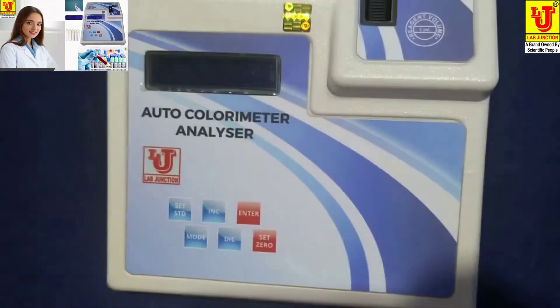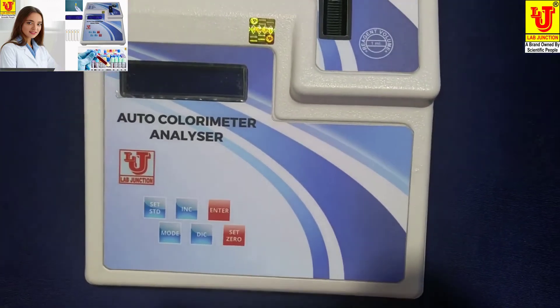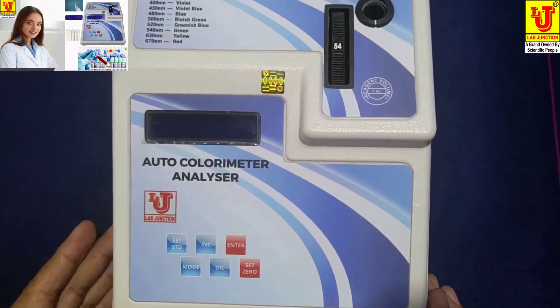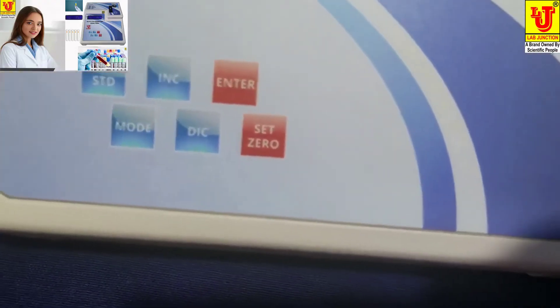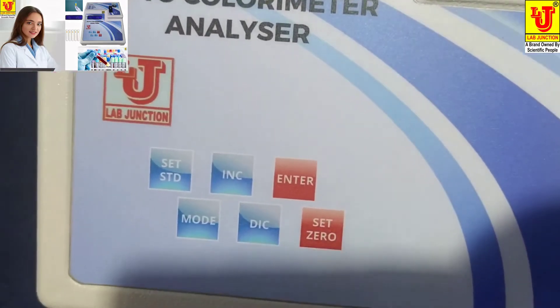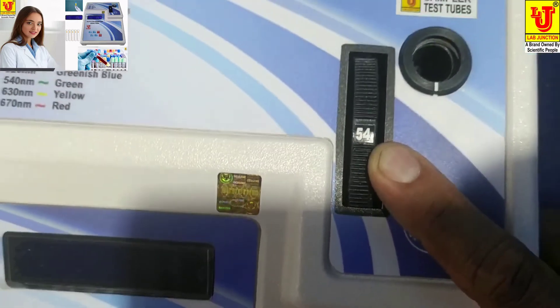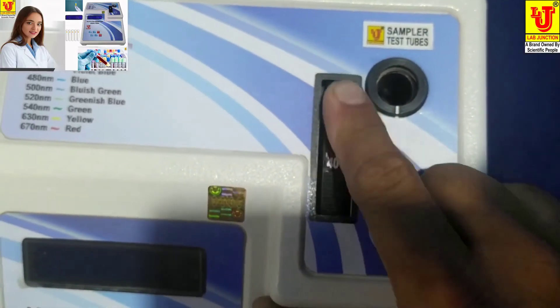Now, how to operate this microprocessor colorimeter or auto colorimeter analyzer. This is the top view of the colorimeter. These are the six keys for operation, and this is the filter disk to select filters. This colorimeter has seven filters.